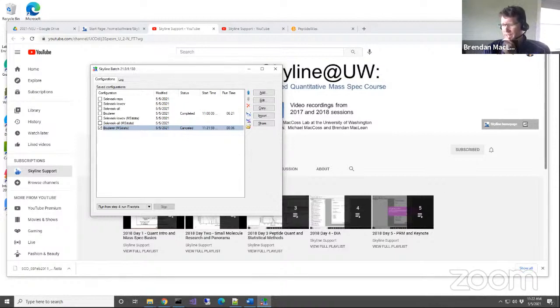If I read search DDA data into Skyline and then want to narrow the target list to just a handful of proteins, I assume, do I have to manually delete the others? Can I search for just the ones I want to keep? Yeah.